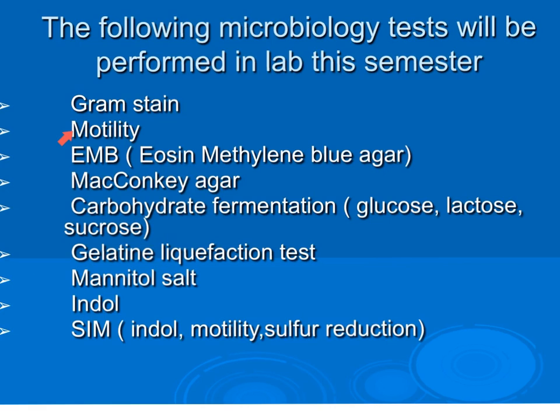Motility is not a very reliable test, and if you can key out a bacteria by not using motility, I would do so. Also, notice right here EMB and MacConkey. Each of these tests for a gram-negative bacteria, and they each test for whether the bacteria ferments lactose. These do the exact same test. So I would not run an EMB and a MacConkey together because I've got an overlap going on. Same difference, I would not want to run a SIM and an indole because you'll notice that SIM does test indole. And so keep in mind that as you pick your tests, you want to make sure that you're not overlapping or wasting test agents.